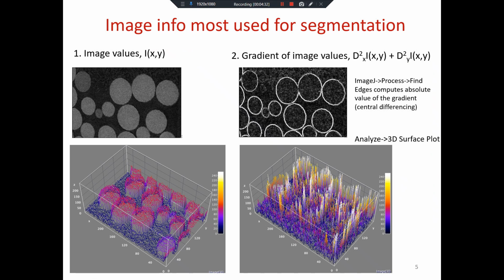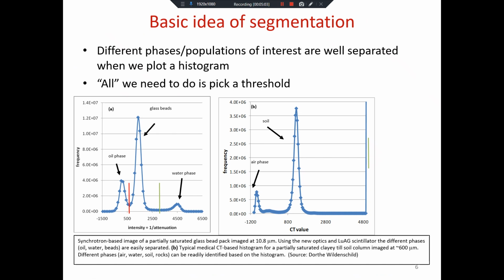And we were also cleaning the images up or filtering the images using these same things. So typically, the only thing you really have is image values and some sort of differences or spatial differences, normalized spatial differences of those values. And any other kind of fancy filters ultimately come up with some combination of image values, possibly normalized in space in certain directions. That's all the filters actually are.